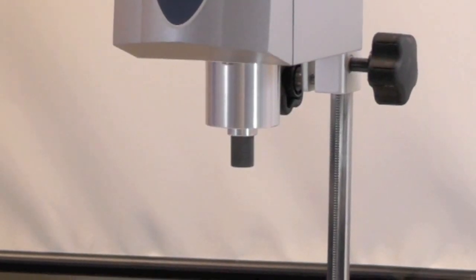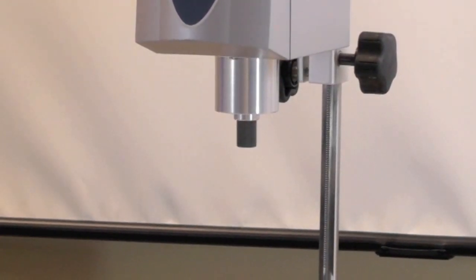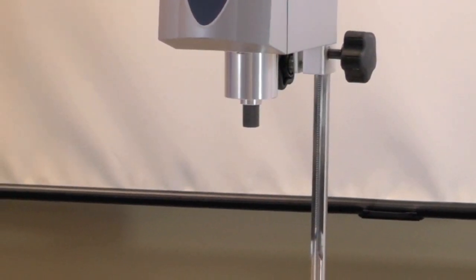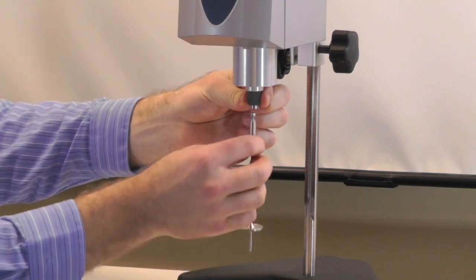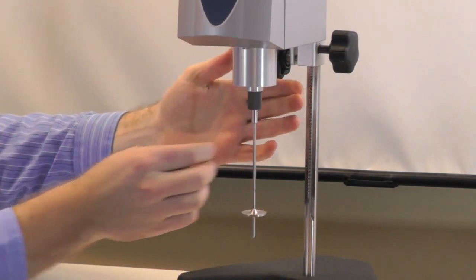Our EasyLock coupling is a spring-loaded system which facilitates the effort of putting on and taking off spindles with one lift of the EasyLock sleeve. You simply lift up, insert your spindle, and release.